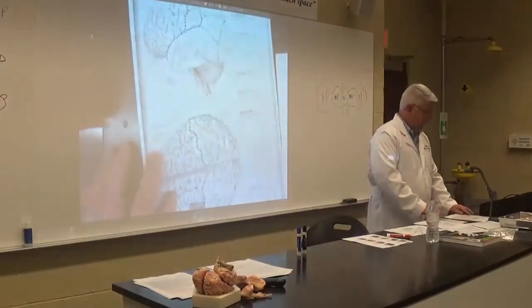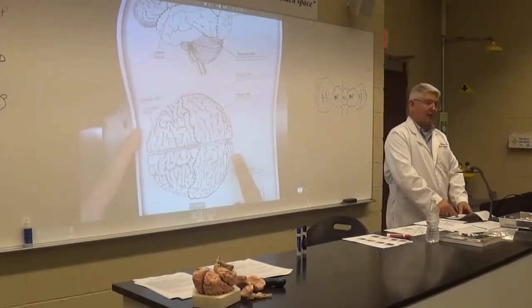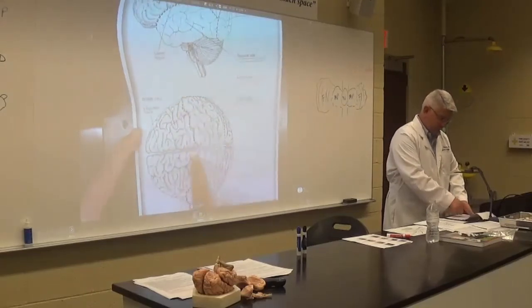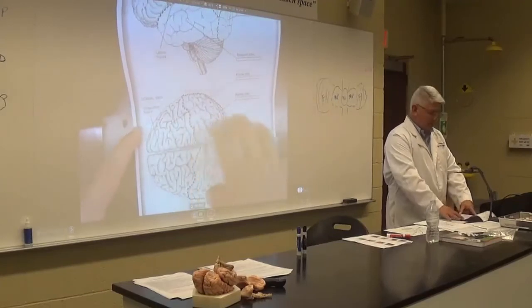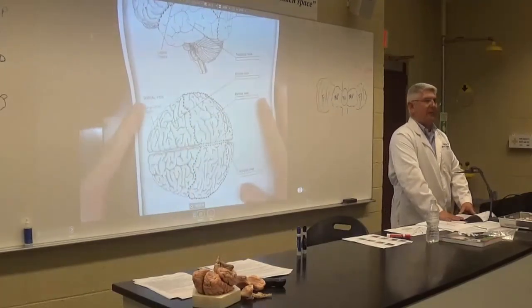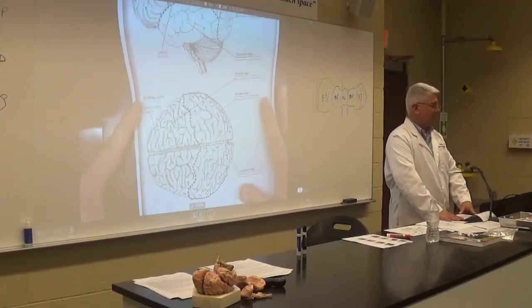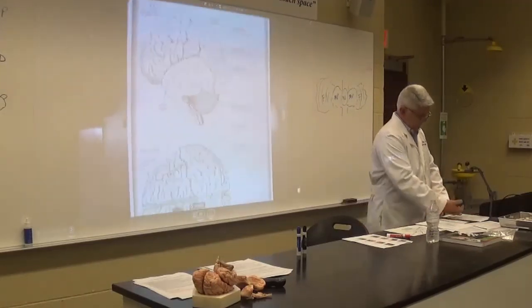Again, this is another orientation. Here you need to orient. Now I'm looking down on the brain: longitudinal fissure, okay, central sulcus. This is not really a fair one. I probably wouldn't use this because what landmark are you missing? How can you tell if you're looking at anterior or posterior? There's no cerebellum shown. That's not really fair, right? You need that to know anterior, posterior. That's one of your landmarks. Okay? All right. That's really because the cerebellum's underneath.